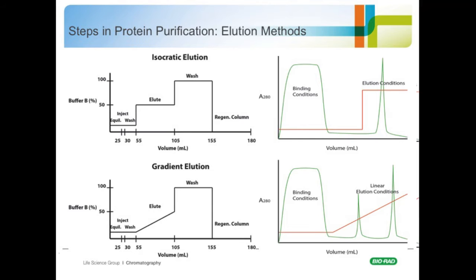But the point of this slide is really to introduce you to what's happening at elution. Again, this is where we're knocking the protein that's been bound to the column off, so then we can go and study that protein, analyze it, or whatever else is planned for it.